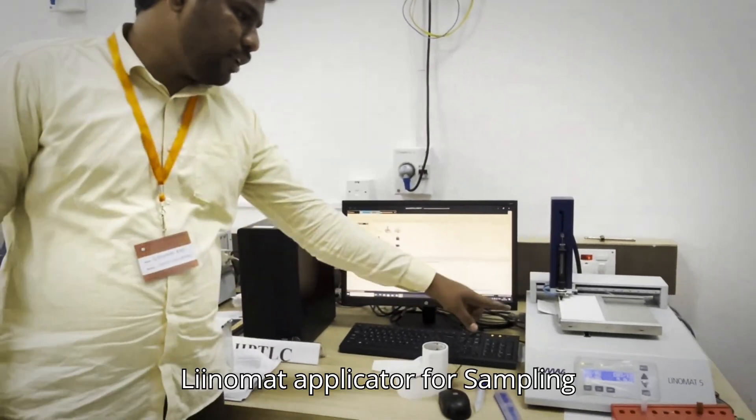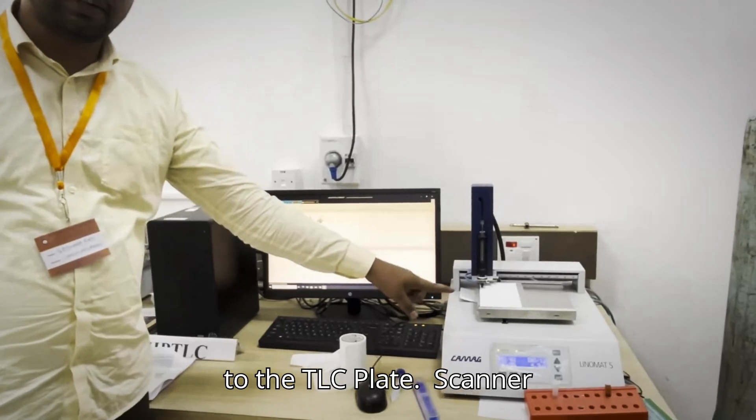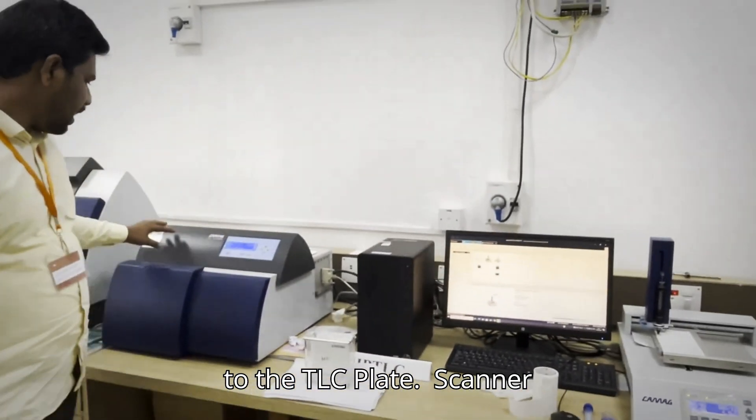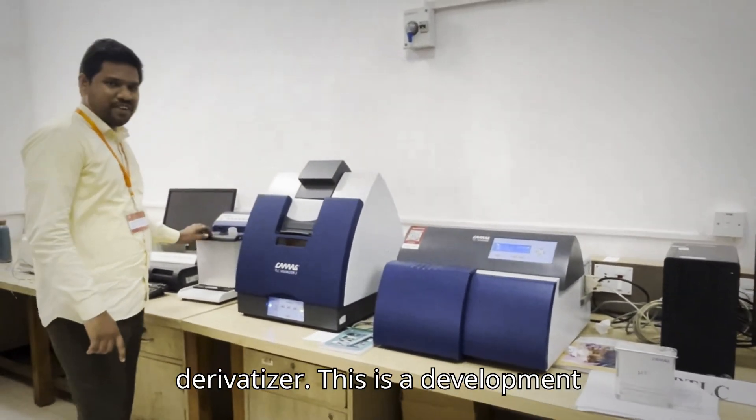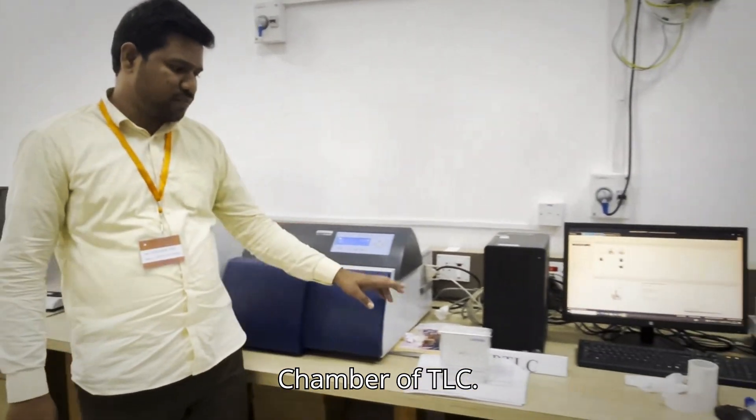This is Linomat, application of sampling to the TLC plate. This is a scanner and this is a TLC visualizer and this is a derivatizer. This is a development chamber of TLC.